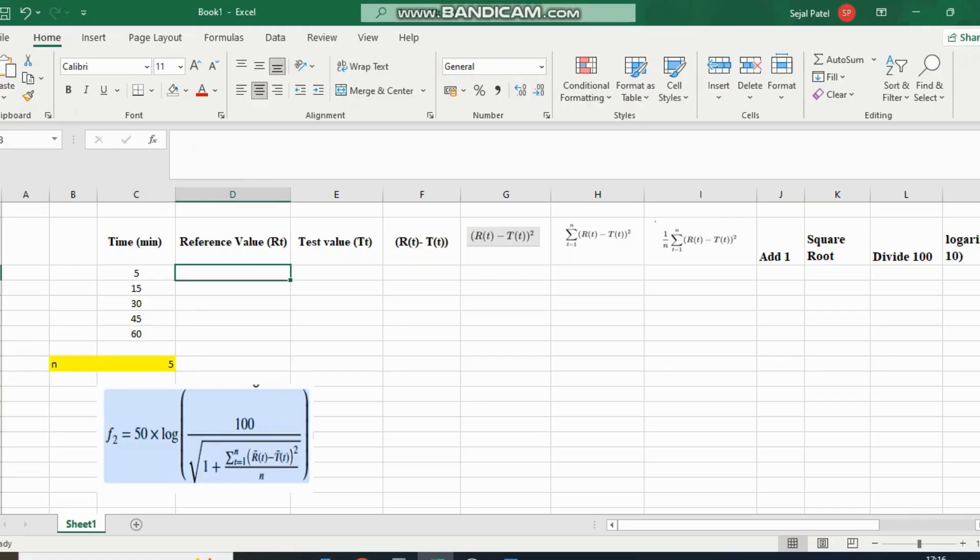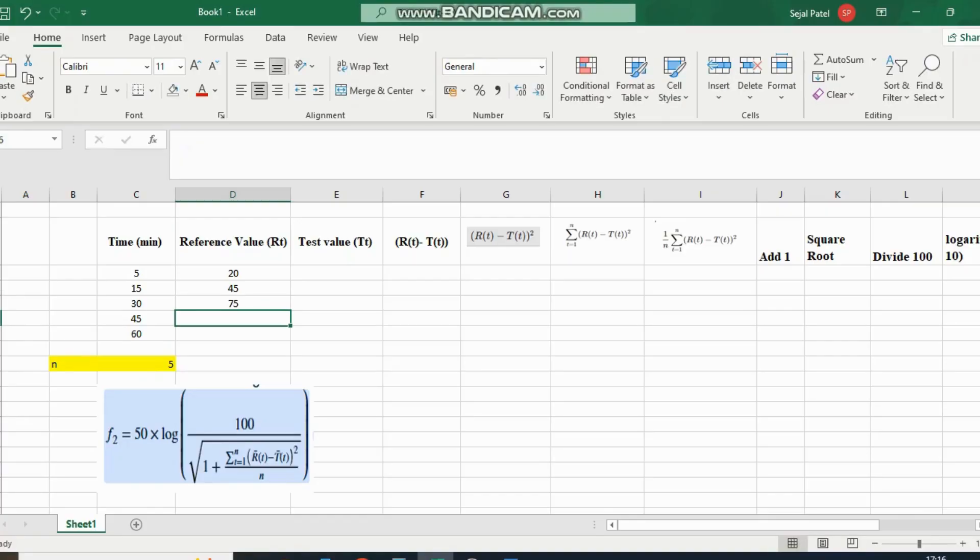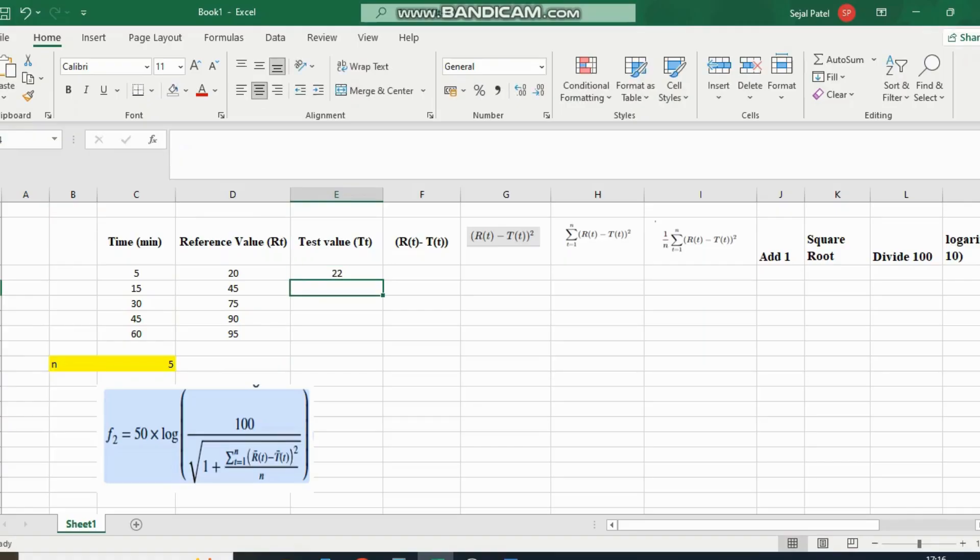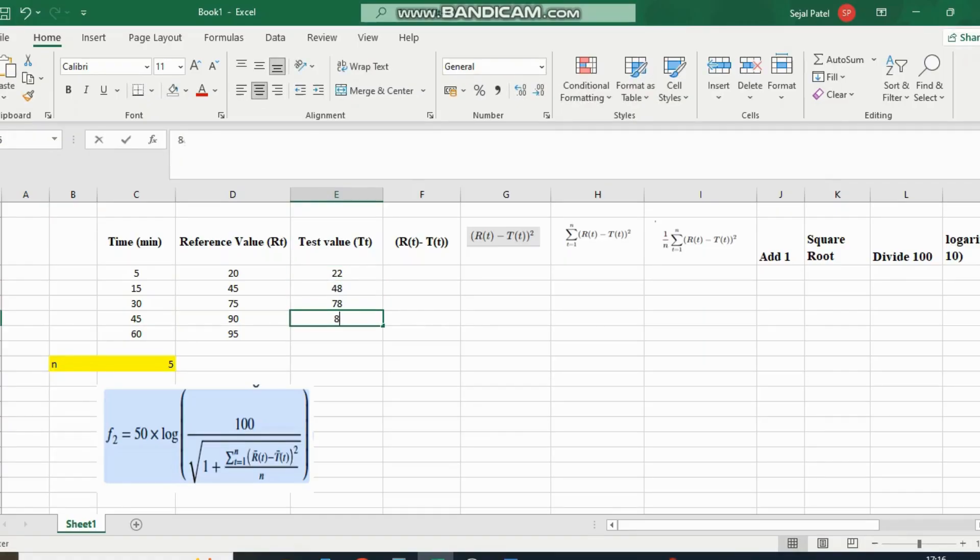Now we'll enter the reference values: 20, 45, 75, 90, and 95. Then we enter the test values: 22, 48, 78, 88, and 94.